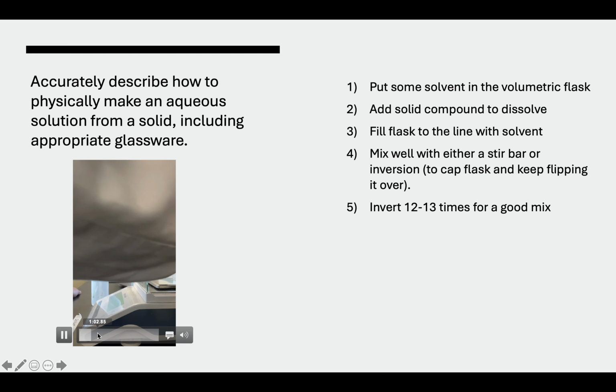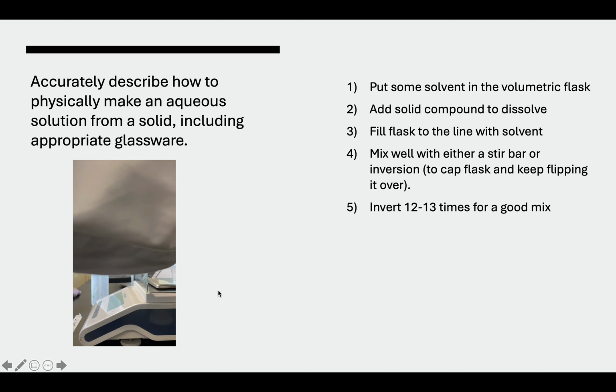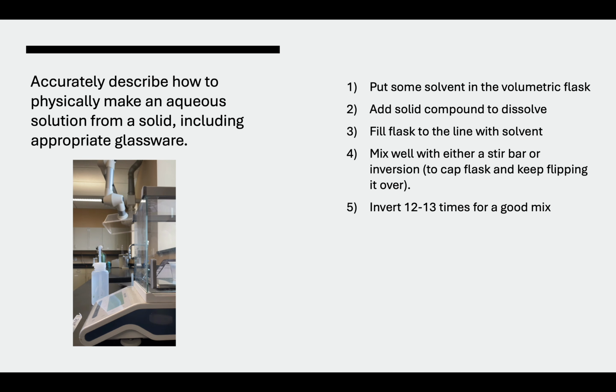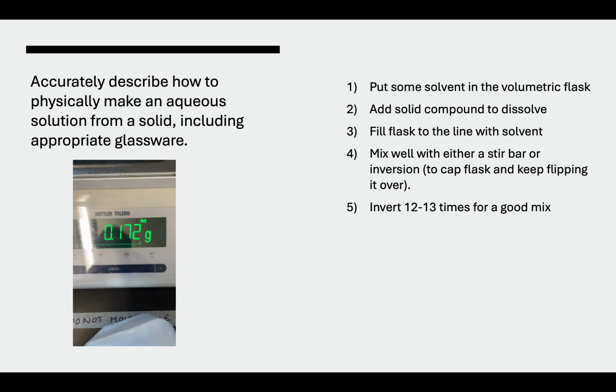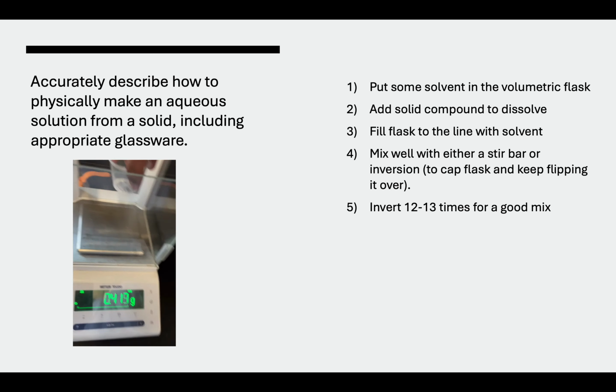Yeah, this takes me a while because I want it to be exact. 0.172. Now we can take the sugar out.